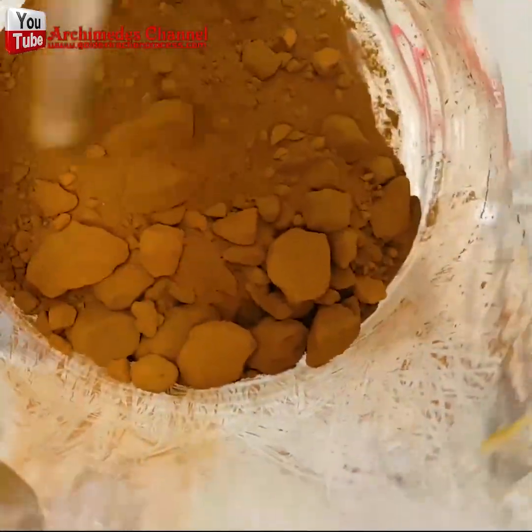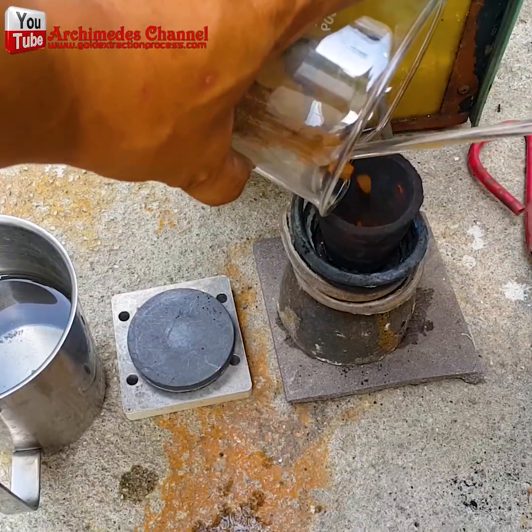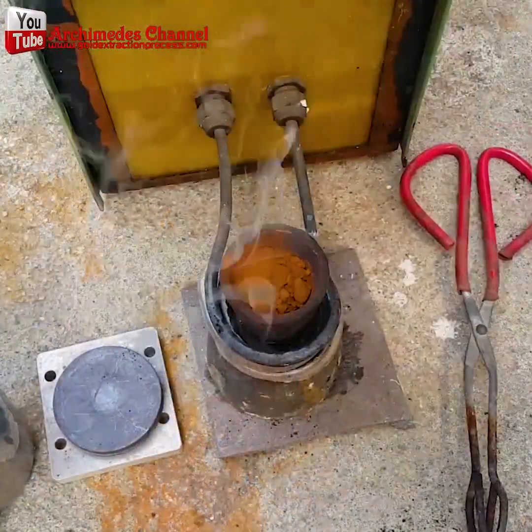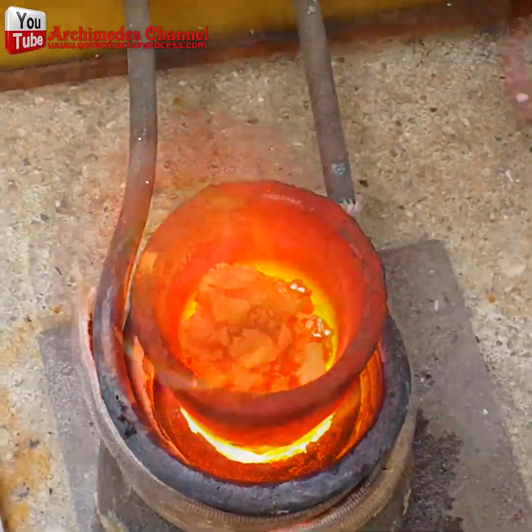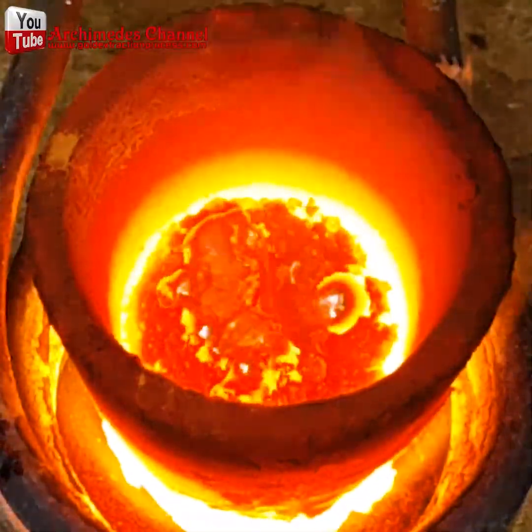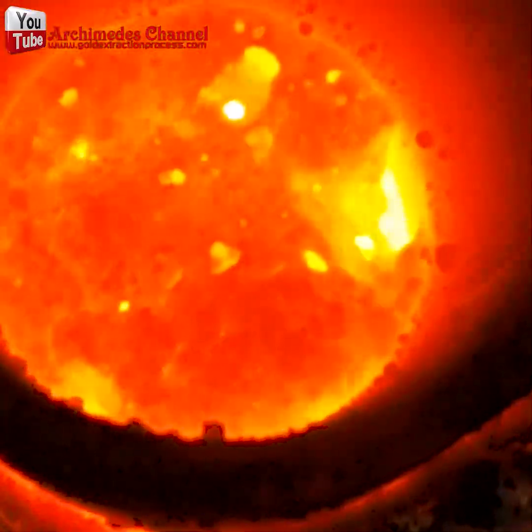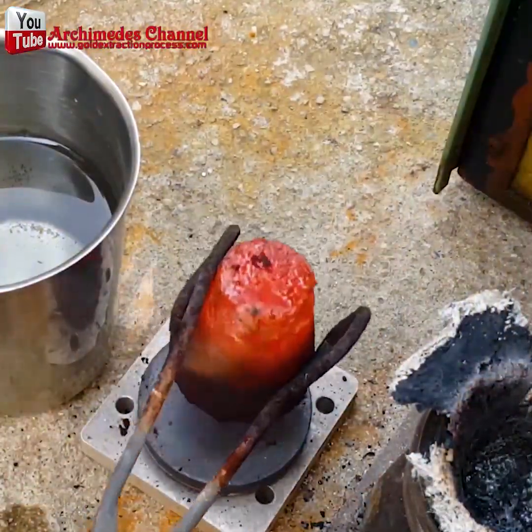As it dries out you'll see it start to take on that color — that brownish gold powder is just a few steps from becoming your own solid gold. Now put it into a crucible and use some induction heating or a torch. In this case, induction heating. A little borax can be sprinkled on to help it all connect.